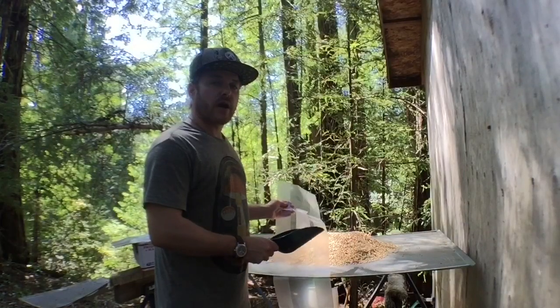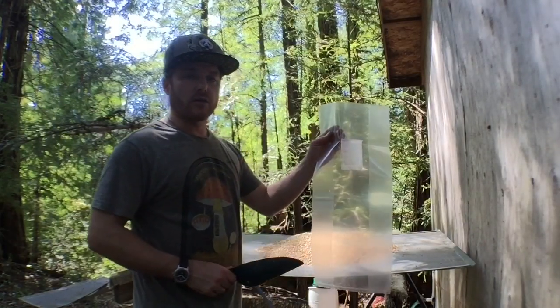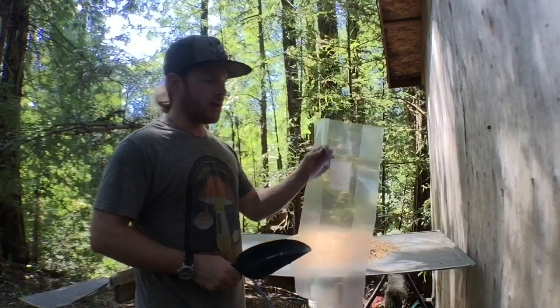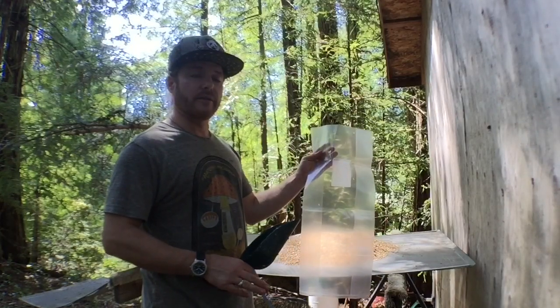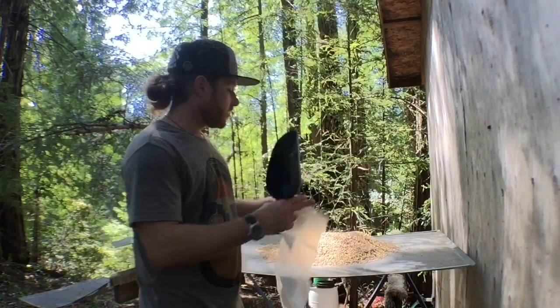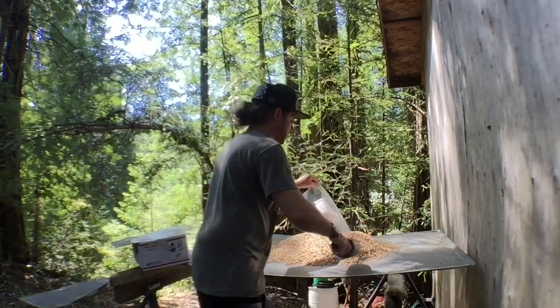Once the grains are dry, we'll then transfer them into our spawn bags. These are the autoclavable bags with a filter patch, breathable filter patch. These are the extra large bags. They hold about 4 to 5 pounds. I usually like to fill them to that, because that's what fits best into my particular autoclave. So we're just going to fill them up. It's usually like 5 scoops or so.